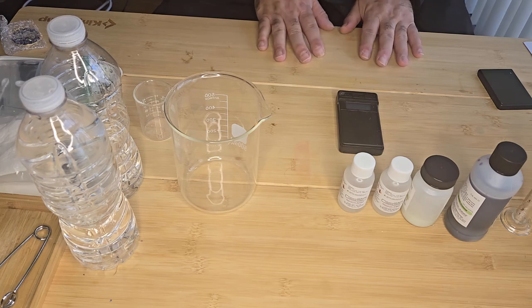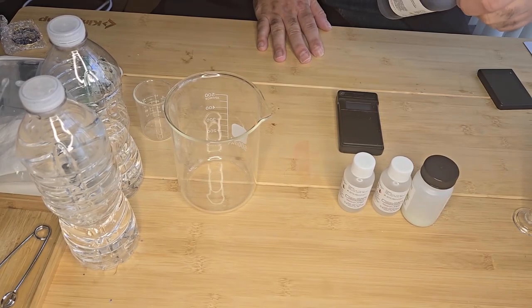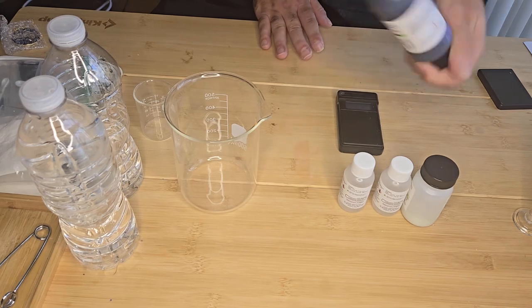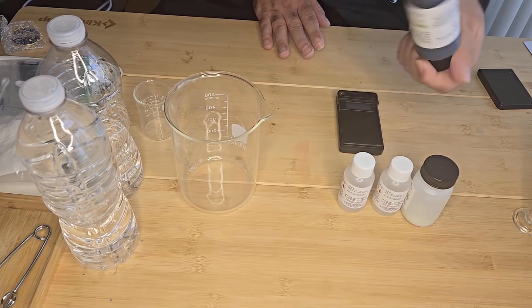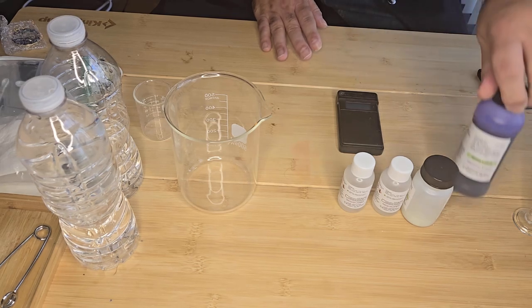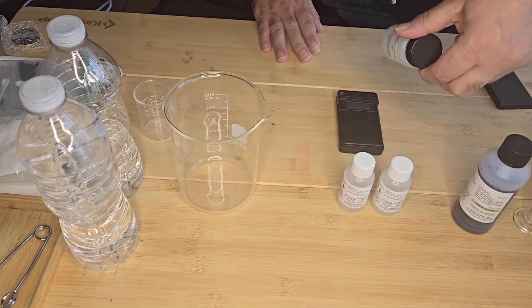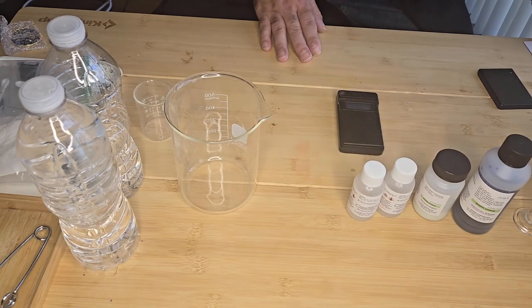Okay, so I got my chemicals lined up. I got the thionin dye that I pre-made. I just added 100 ml of water to the powder, and that's now nicely dissolved. I've got iron chloride, iron sulfate, and sulfuric acid also.